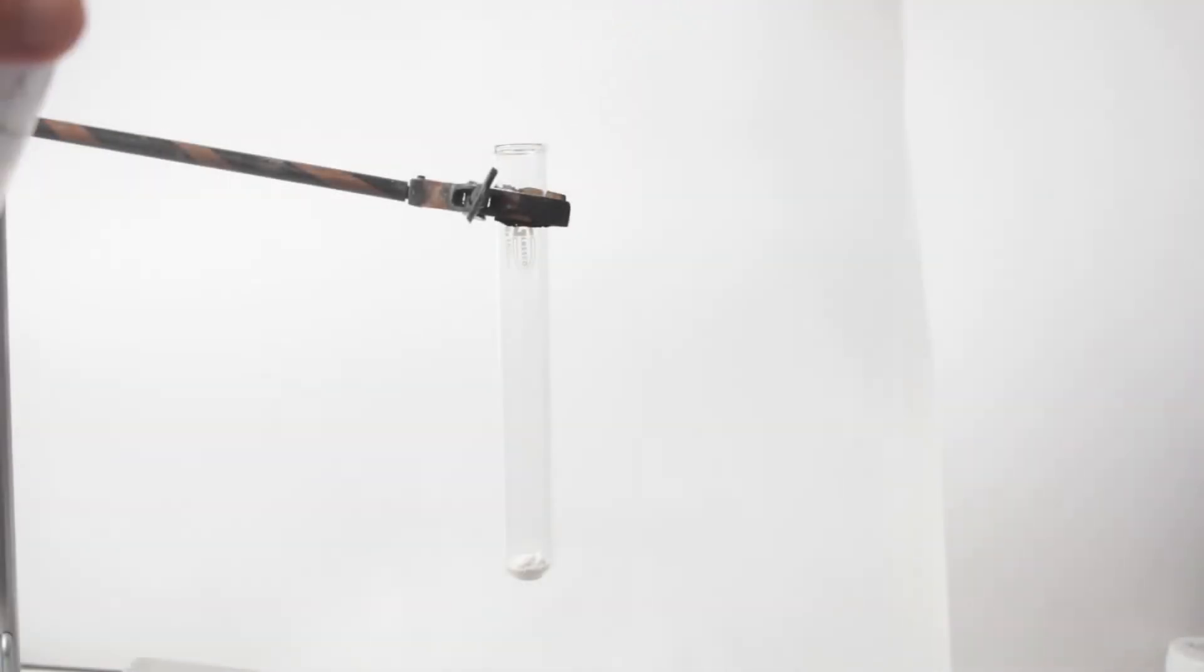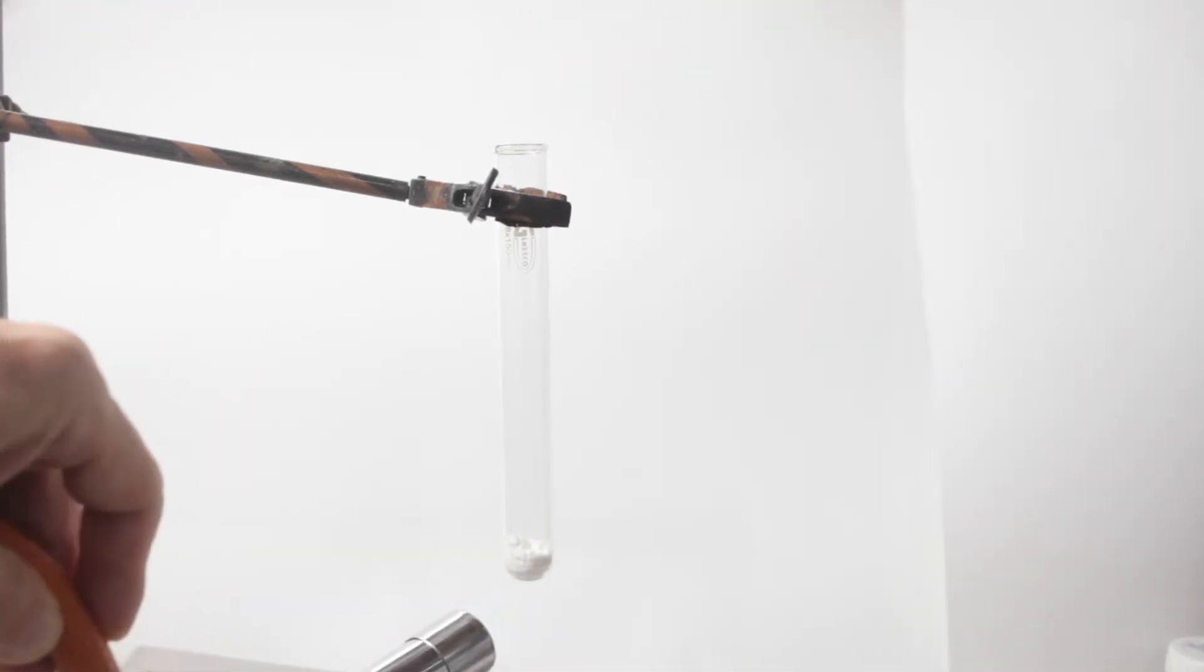Potassium nitrate is a white salt with a rather low melting point, about 334. It melts easily and already at 400 it starts decomposing.